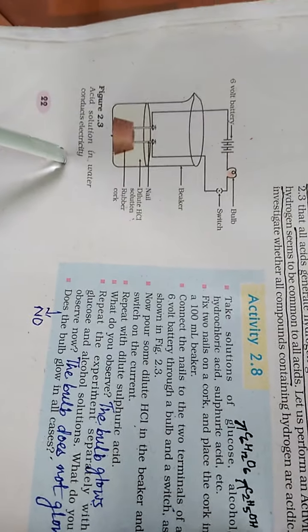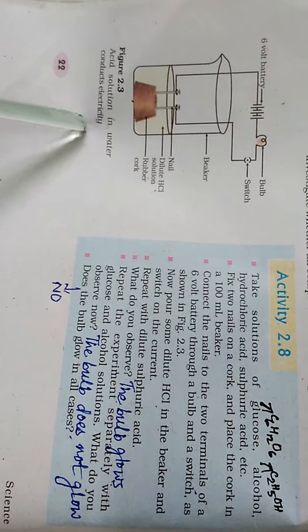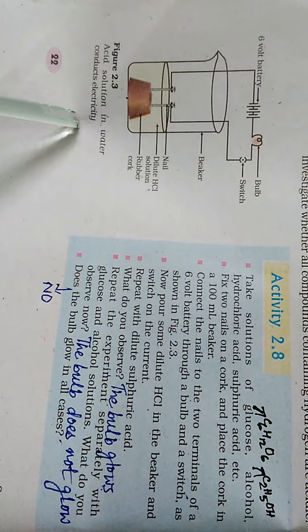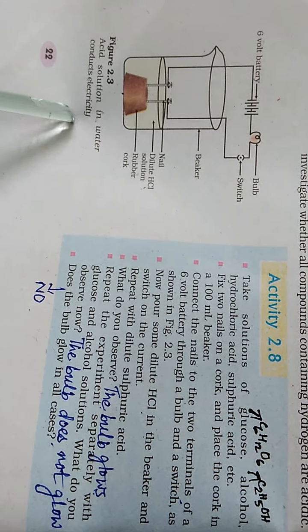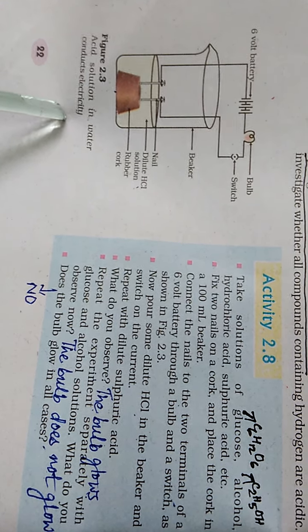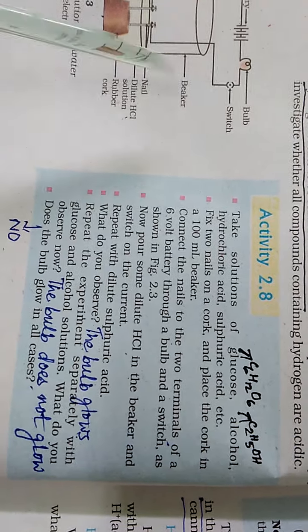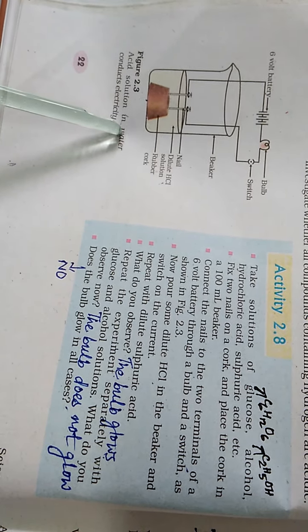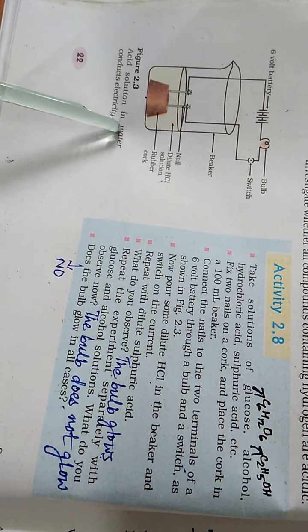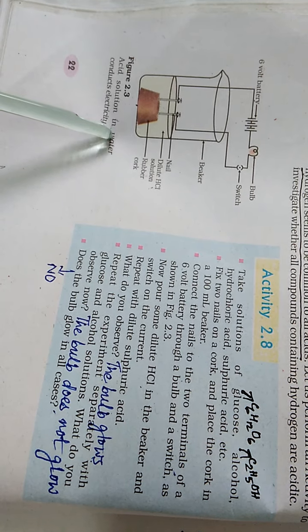We repeat the same experiment with 50 ml of dilute sulfuric acid. This time also the bulb glows. The glowing of the bulb indicates that solutions of hydrochloric acid and sulfuric acid conduct electricity. Then we repeat the same experiment with glucose and alcohol solutions. We switch on the current, but the bulb does not glow. This indicates that solutions of glucose and alcohol do not conduct electricity, unlike hydrochloric acid and sulfuric acid solutions.